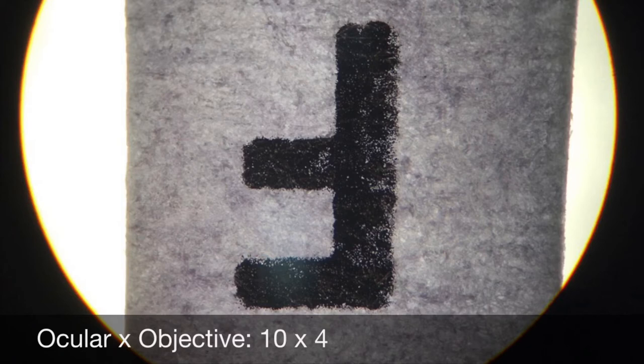Furthermore, explain in words the differences between images observed with your naked eye and under the microscope.